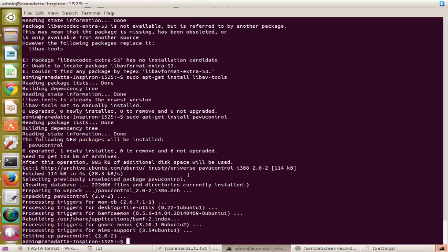So in this video I am going to give just a little introduction about the commands which can be used on the fasta files, and once again these commands are very useful for beginners. These are not exclusively for very experienced people. They might find these things trivial, but these would be very helpful to beginners. So let's get started.